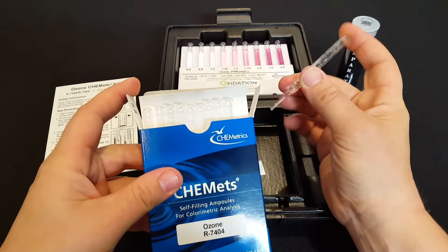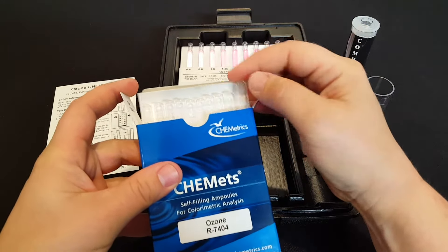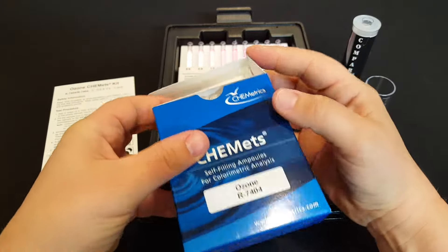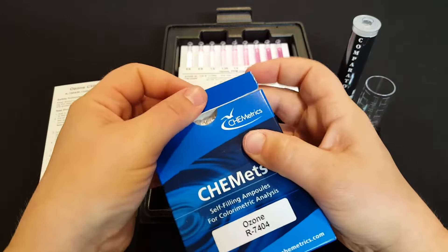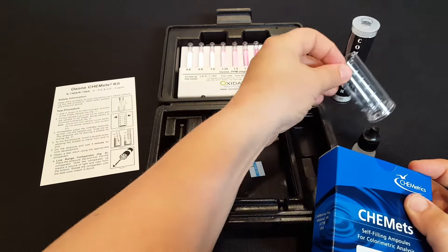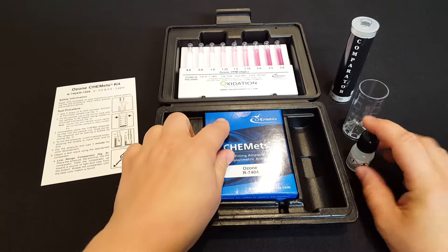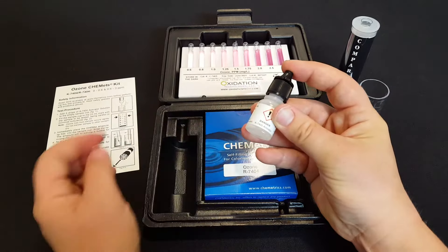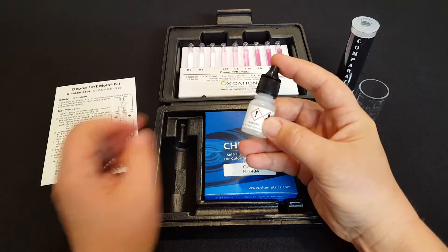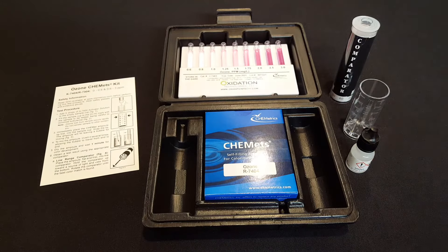The ampules are replaceable — we carry them on our website and you can buy replacement ampules to use with the permanent parts of the kit, which are the comparators and the cup. The activator solution is also used up and can be purchased individually on our website, and is likewise used with the permanent pieces of the kit.